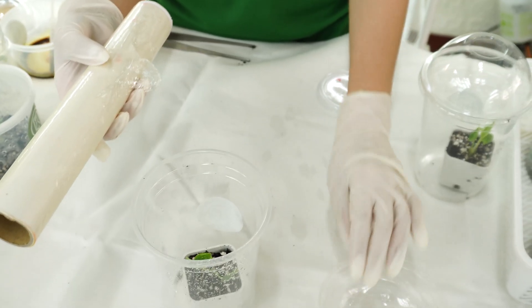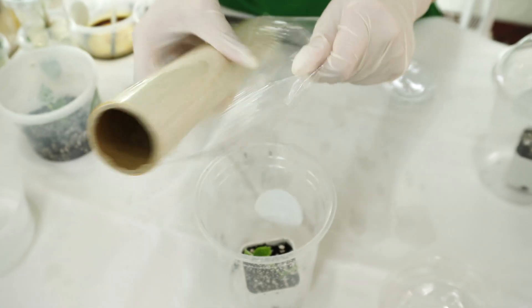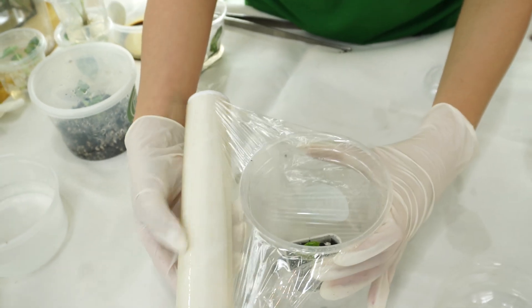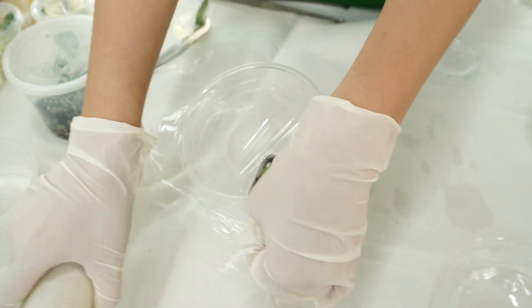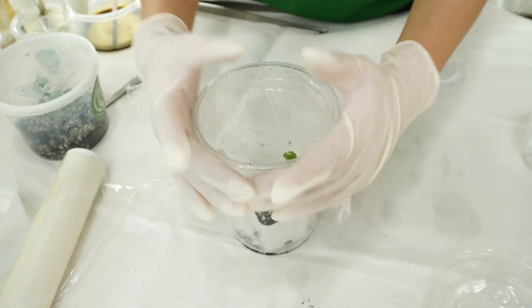Just in case you don't have a lid or cover for your container, you can use kitchen wrap to wrap the top part — that is also doable. You'll just have to remove it and replace it each time you need to water the plant.